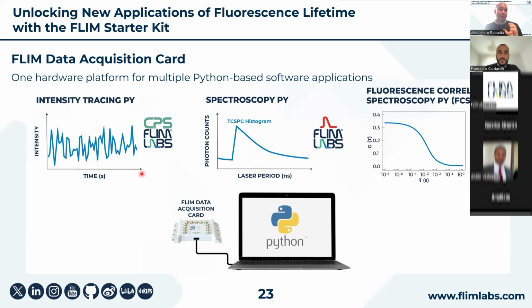So basically, we have one card but multiple Python-based software applications. We have a simple software for measuring the photon counts coming from our detector, some kind of advanced photometer. Then we have a spectroscopy software, which is meant for time-resolved measurements, which I'll demo for you in a bit.